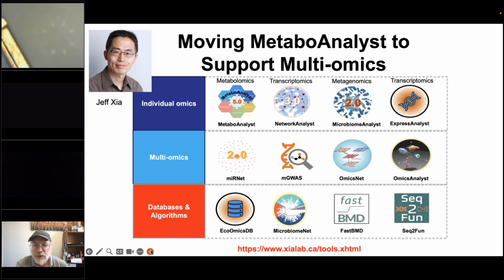This is an example of how, essentially taking his PhD thesis work on MetaboAnalyst, he was able to take existing tools and rebrand them, in some cases adding a few more tweaks and bells, but not much really, to create a whole library of very useful tools. In that regard, I think it highlights the fact that what you do in metabolomics opens the door to lots of other multi-omics analyses. And the path to do that is often through software and databases.